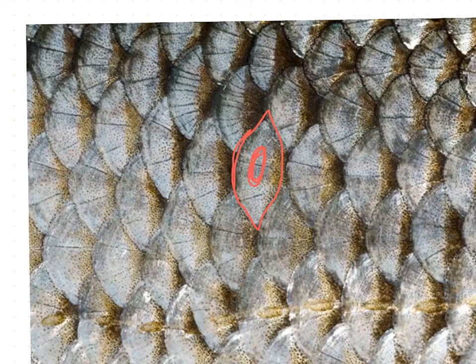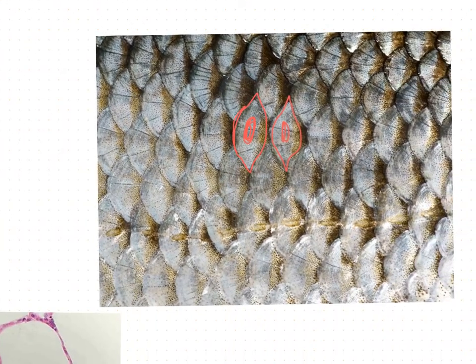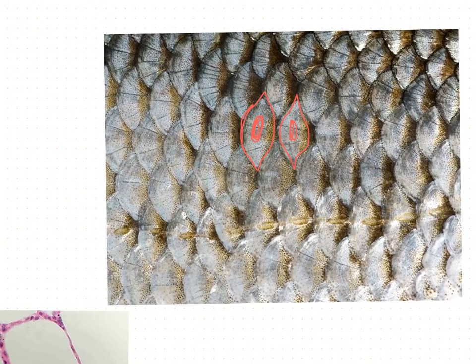So that looks like a squamous. Another one, squamous. So that's just a way I like to think about the shape. It's not exactly completely flat. It's more like there's a bulge right in the middle as well.